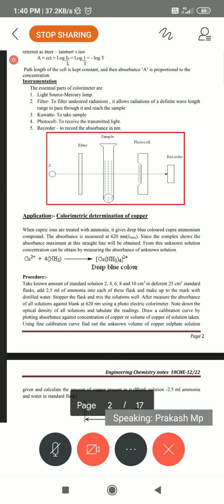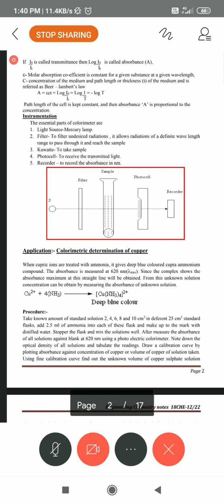If you want to dissolve it in 1 liter of DM water, of course you need not measure the water exactly, you prepare the unknown solution. If you want to find out the percentage of copper, you prepare the copper sulphate solution. Whether it is unknown or not, don't throw it away. If you want to find the percentage of iron, you prepare iron sulphate, FeSO4.7H2O, and weigh it. Even if not weighed, you prepare the solution, but don't throw it away.